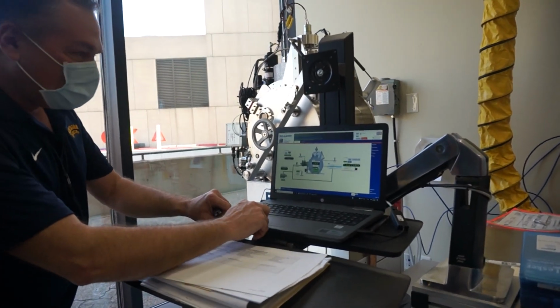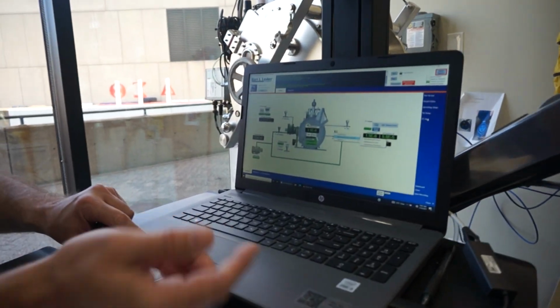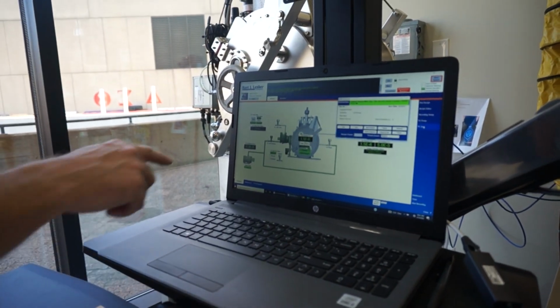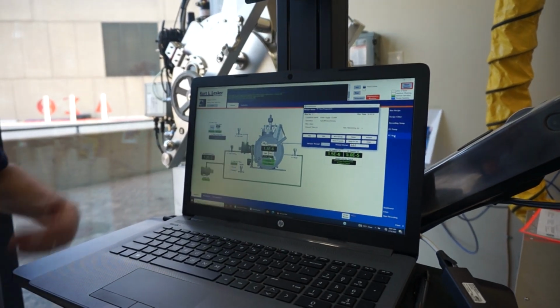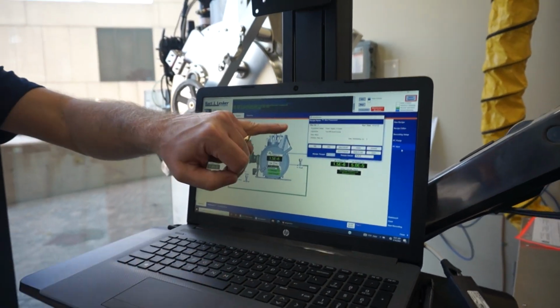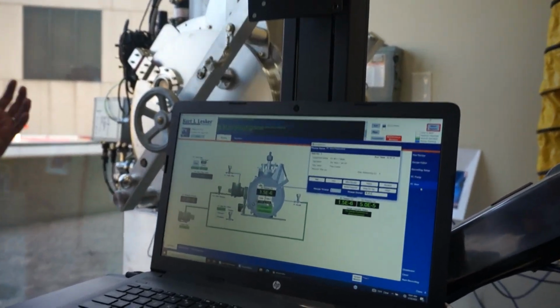Nice. So you look over on the right-hand side, we have PC pump, PC vent. So PC, process chamber. Click that, and a recipe screen will pop up. The first thing it's doing is executing each line of this here. And we have a program written called PC vent preparation.